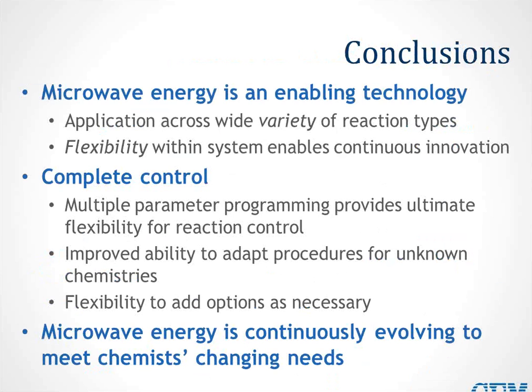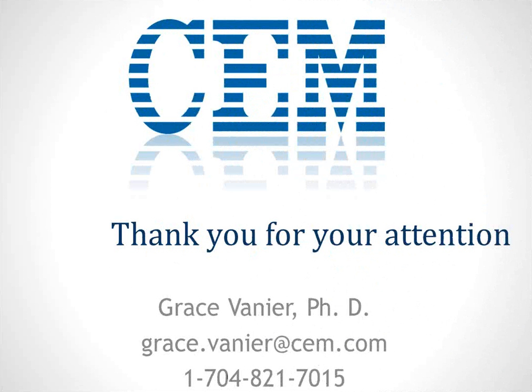All right, so with that, I'd like to finish up. I hope you've learned that microwave energy is an enabling technology with which you can do lots of different types of reactions. I wanted to highlight the SP, but as I mentioned, there are lots of different types of reactions. You can do a simple literature search and probably find dozens of examples. And you get complete control. There's a lot of flexibility with these systems for programming them and for how you want to run them, and lots of different things you can do with the accessories as well. You can see from all the options available that it's continuously evolving, so you'll see new methods, new techniques, and perhaps even new instrumentation coming down the line in the future.